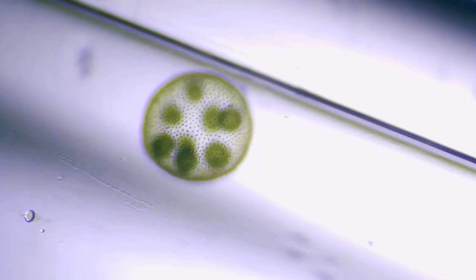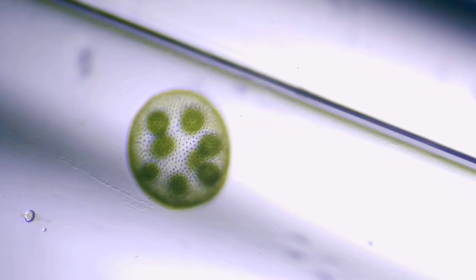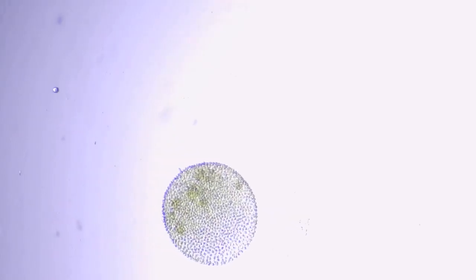Volvox is a fascinating genus of green algae that forms colonial spheres of cells, showing a key transition between unicellular and multicellular life.